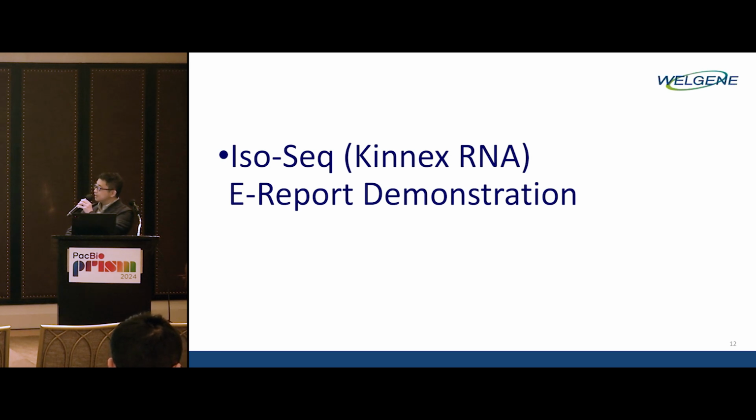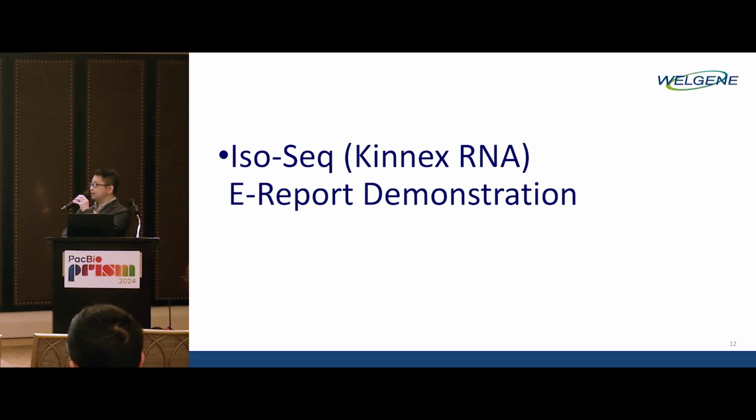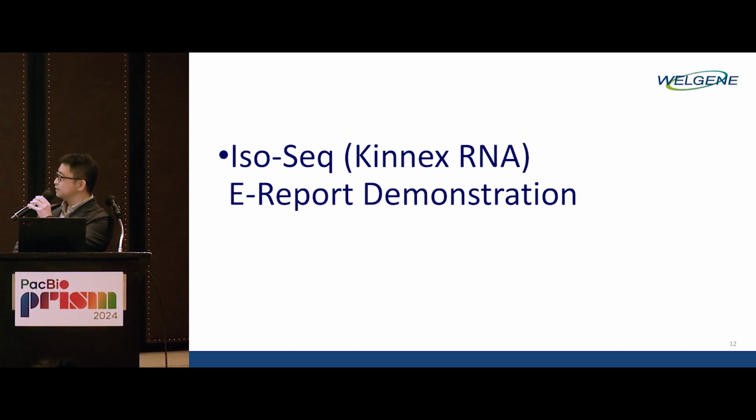Now you can see the sample length distribution will show here. It's about 2,000 bases. As Dr. Liu and Liz mention, in the 10 million reads, about 80% to 90% of the known isoforms will be detected at the 10 million saturation. This is the detected isoform saturation curve.